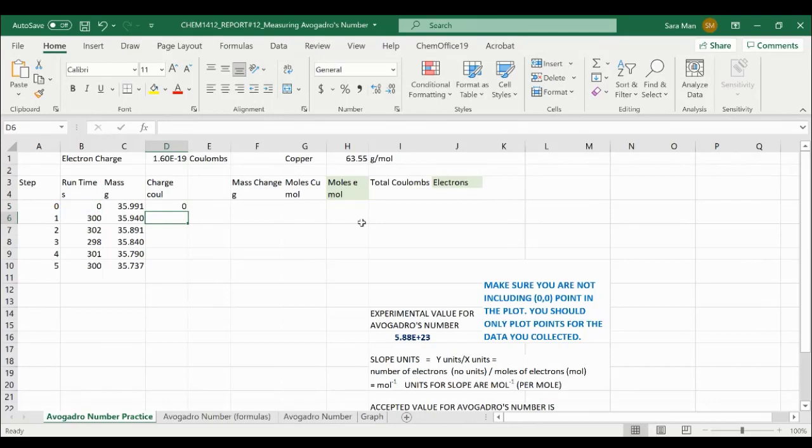And then enter. And I don't have to do it for all of them. I just look at this little cross. I extend it down, and Excel is doing it for me. So this is the first part that we have to do in Excel. Just prepare a table similar to mine and bring the raw data from the sample data.